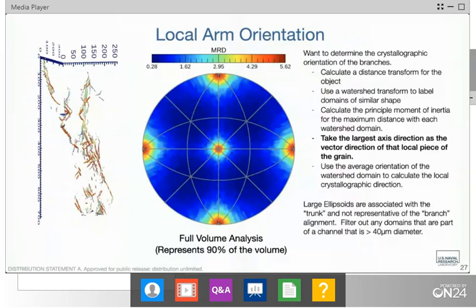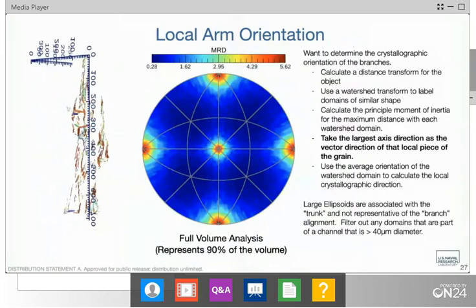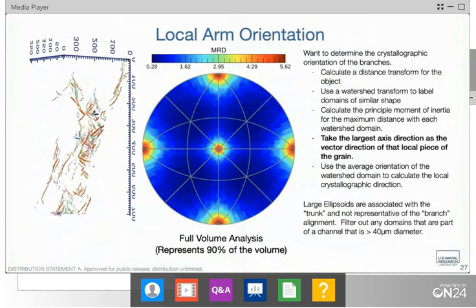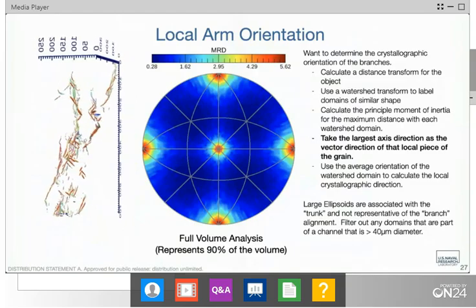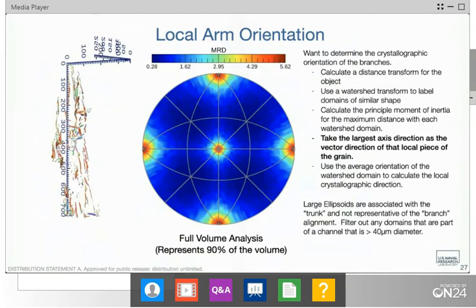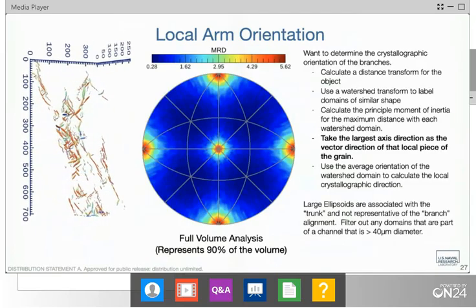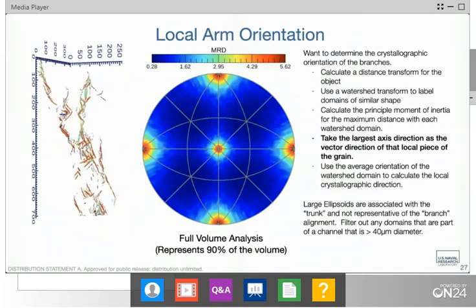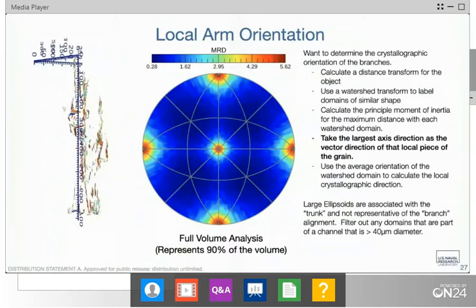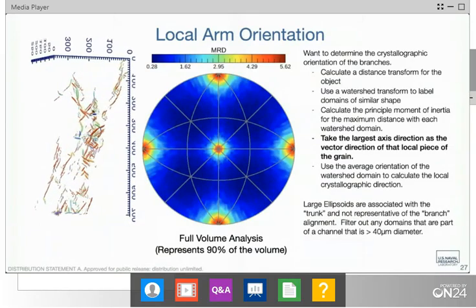So that meant that every day we'd have to have somebody come in, pull the sample off, and do the indents. We didn't have an automated indenter that would do that for us, but you could certainly conceive that something could be constructed to do that. But the other thing is that a lot of times we can use the microstructure for alignment. And so the fiducial marks are a handy thing for looking at depth removal, but they aren't as critical for looking at microstructural alignment. And so that's just kind of one of those things.